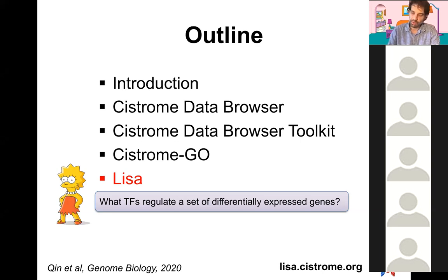Yeah, so Ramesh, we should have a look at the Cistrome-GO output together, and we can evaluate how it looks. Because with BETA, a lot of people had some troubles using it, so we'll probably use Cistrome-GO instead of BETA.